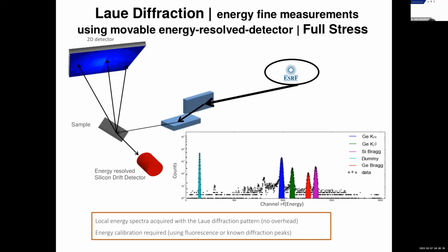We are in the reflection geometry, and in this geometry the two theta angles correspond to a region where the disorder is not so large. If you are trying to measure protein, there is generally a resolution limit, and the disorder happens to be high for 2 theta equal to 90 degrees.